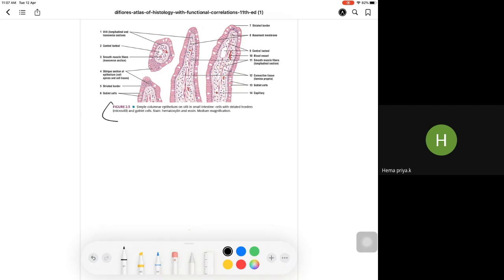As you know, this is the longitudinal section and this is the tangential section. Now you know how you can see the longitudinal, and when you cut like this and see, you will see the transverse sections. And another thing you have to remember, these empty spaces are the goblet cells. Goblet cells are nothing but mucin secreting cells, and all the other cells are absorptive cells.